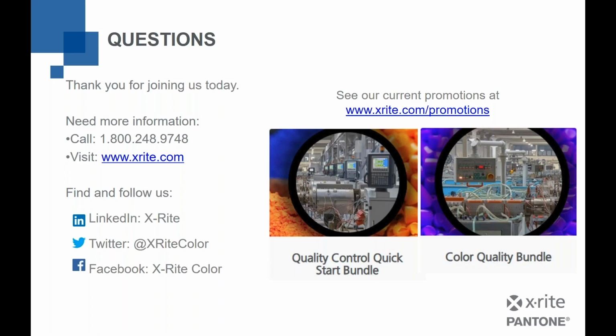We've done a webinar in the past going more in depth about illumination, so I would recommend you get to that on our website and get more information there. But it's kind of hand in hand. Tolerance on its own doesn't tell you everything, right? We need to know the tolerance. We need to know the geometry or the type of instrument being used. We need to know what illuminant observer is being used. All those things have to be equal in order for us to get comparable data.